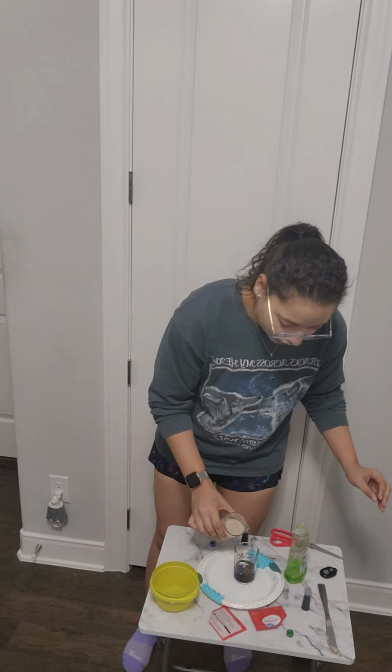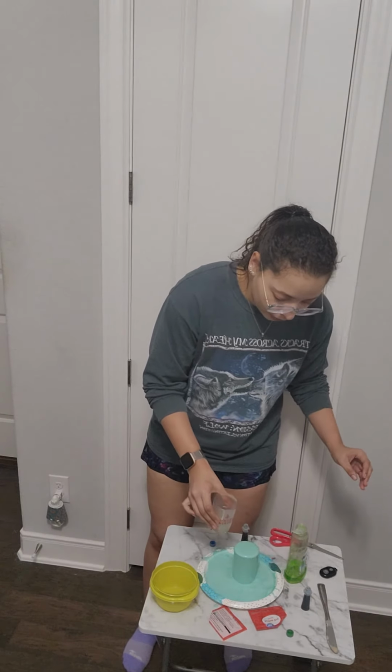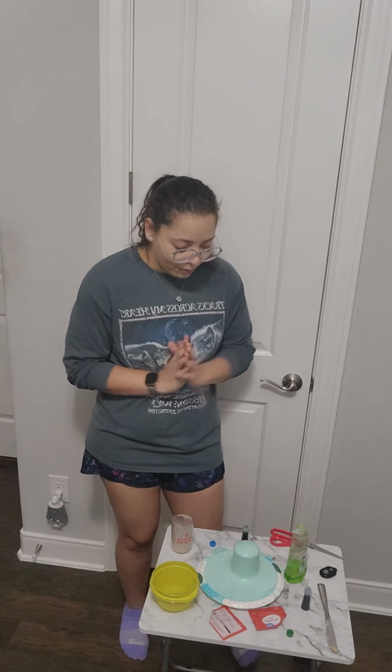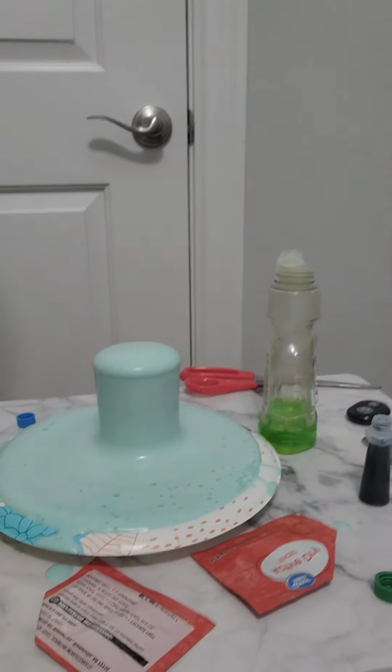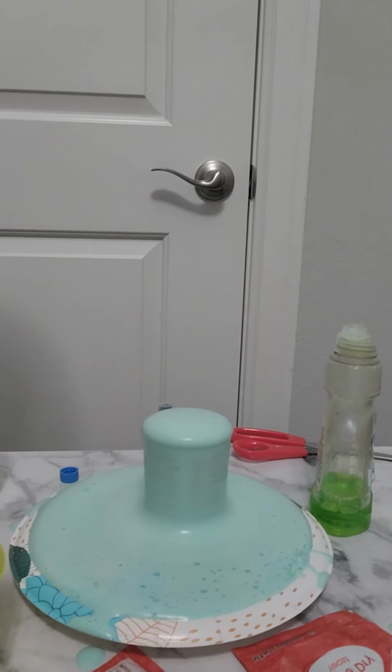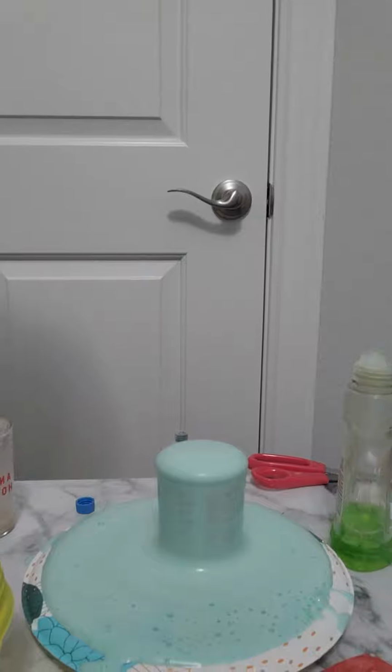and then yeast. Oh, okay, so I made more of a mess than I had intended, but I don't know if you can see. We have our foaming action going on here. But that is our elephant toothpaste experiment for this week.